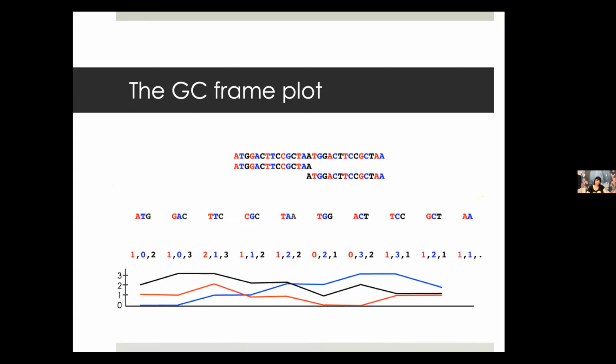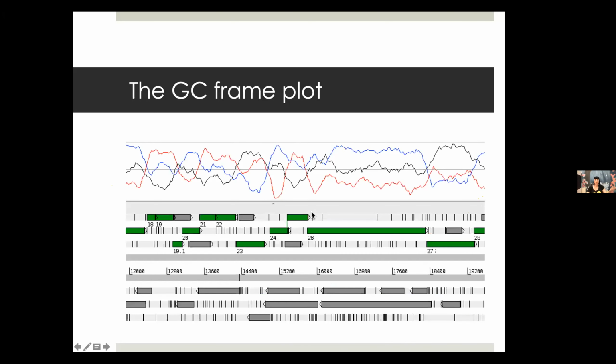So this is kind of probably confusing, but let me show you some real data. This will show you how clear the signal really is. So here's the same high GC content genome that has those spurious non-coding ORFs. And you can see that the GC frame plot up at the top is created by the Artemis plot, which I'll show you how to use. And you should be able to clearly see the very distinct line patterns that match the green coding genes.